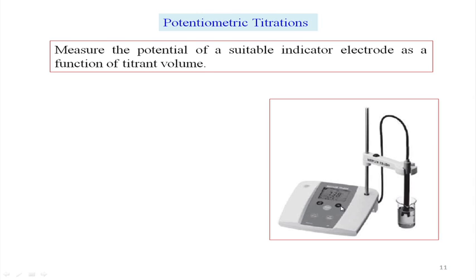You can directly measure the pH, for example 7.38 from this display, or you can switch to the other reading for millivolt measurement, because what we measure is the electrode potential, and that electrode potential is directly converted to pH values. So, it is either a pH meter or a device for measuring electrode potential.